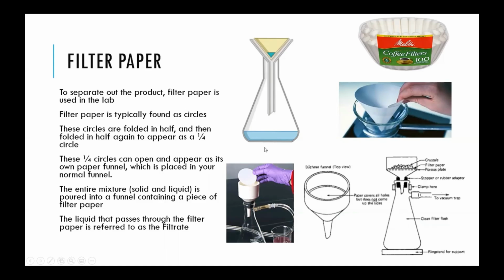There are a few different types of filter papers depending on the thickness and the packing of the fiber of the paper. Smaller particles can pass through or not, and the time it takes can also change. And there are two primary ways to filter using filter paper.